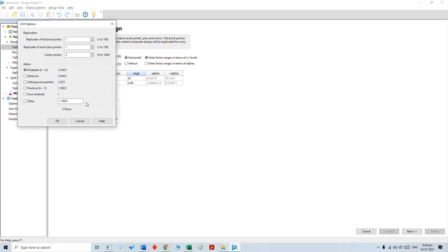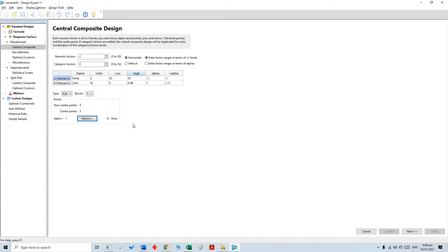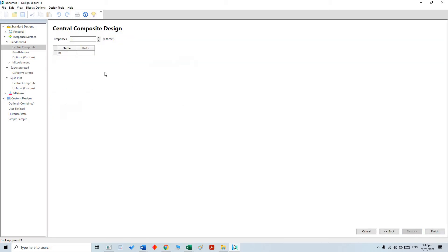Next, we are going to click on this option and select the face-centered option. Information and literature about central composite face-centered and response surface methodology is easily accessible and can be found easily. We are not going to go into very deep theoretical detail. Once our input parameters and ranges are inserted, the next step is to select the response. We have only one response here, but there could be multiple. Our response is viscosity.